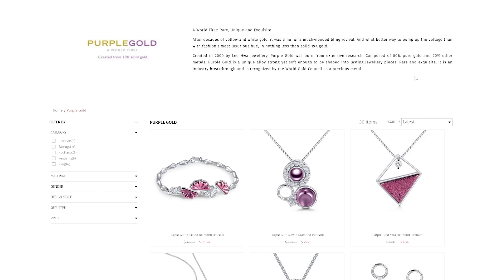This purple gold is pretty cool, but let's see if we can figure out a way to turn it back into regular gold. One thing I know is that if you put aluminum in sodium hydroxide or potassium hydroxide, it reacts with the hydroxide ion and forms sodium aluminate. Because aluminum reacts readily with sodium or potassium hydroxide, I want to see what happens when I put the purple gold in potassium hydroxide — let's see if the aluminum will just get picked out of it and leave the gold there.